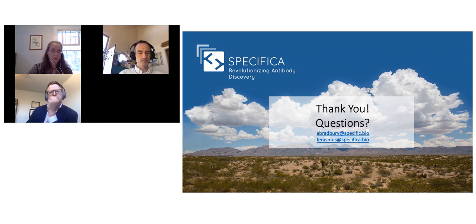Okay. So that may mostly address the next question, which is, are your donors healthy? Which B cell population are you using for your library, naive, memory, or plasma? So the donors, we choose healthy donors, but if somebody wants a library made of unhealthy donors, we'd be happy to make that. Well, actually, healthy. I mean, some of them smoke, some of them are quite obese. So whether they're healthy or not is another matter. But they're ostensibly healthy. Which B cell donors are you using? Again, they're mainly naive and memory.